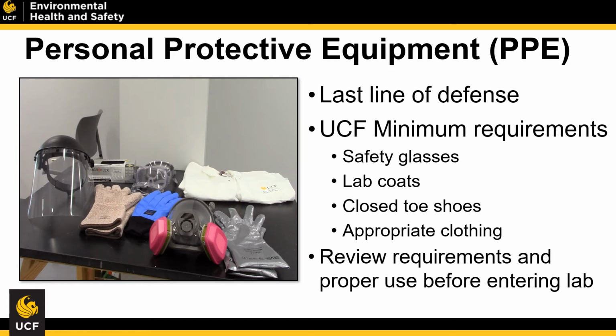For cold temperatures, we're going to ask you to do the same thing, but you're going to wear special cold temperature gloves. We don't want your skin to be exposed to any level of frostbite or icing. And same thing with the face shield. If you're working with cryo material, we want to make sure that there is not an exposure to a droplet of liquid nitrogen, which could expand more than 700 times its original liquid volume. If a droplet is released by a dewar, it will hit the splash shield on the mask first before going towards your face. It's just one other way that we can minimize the risk of exposure.